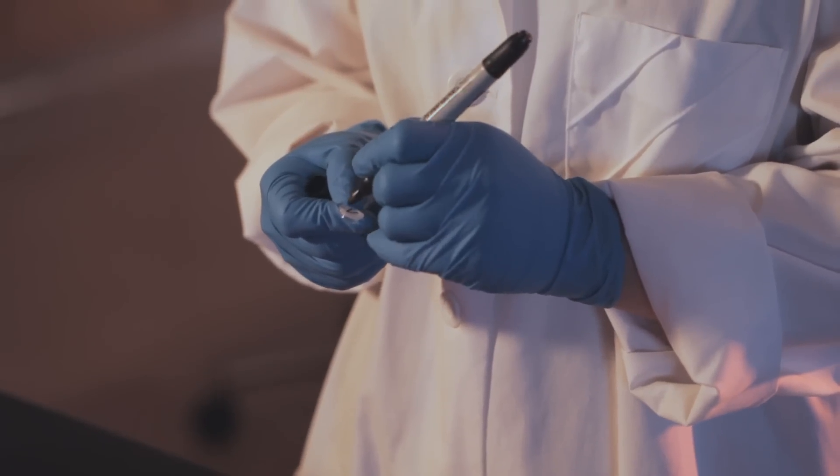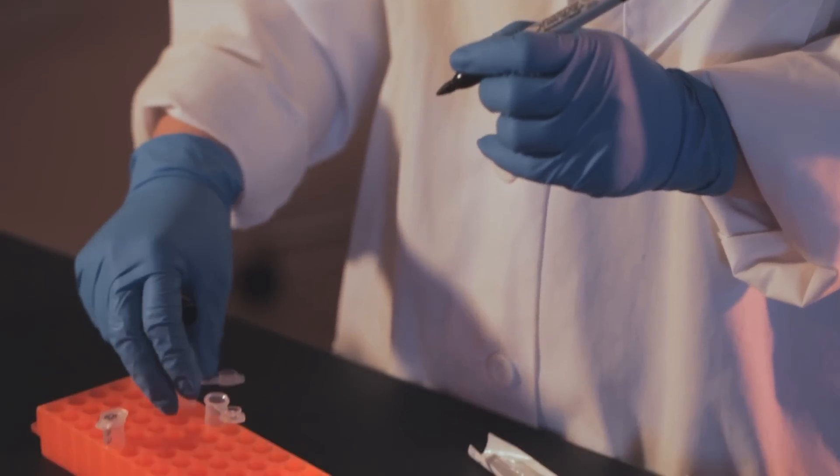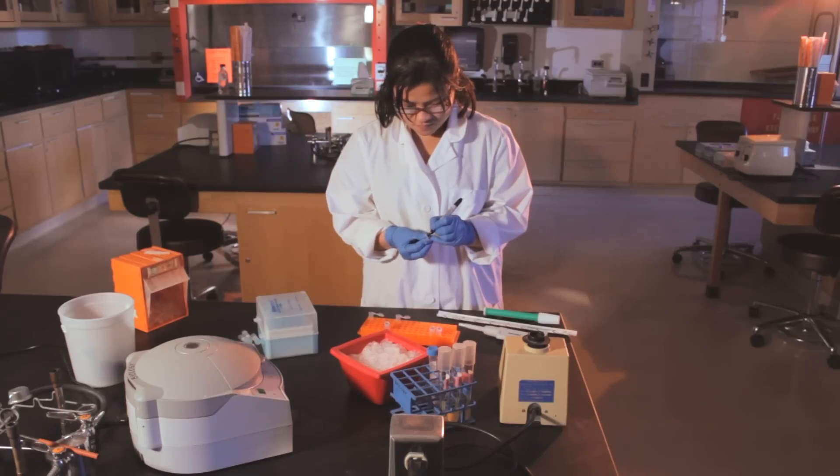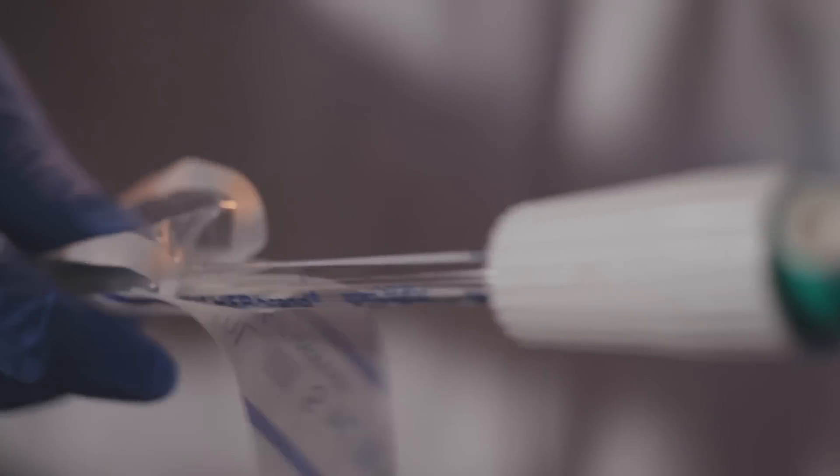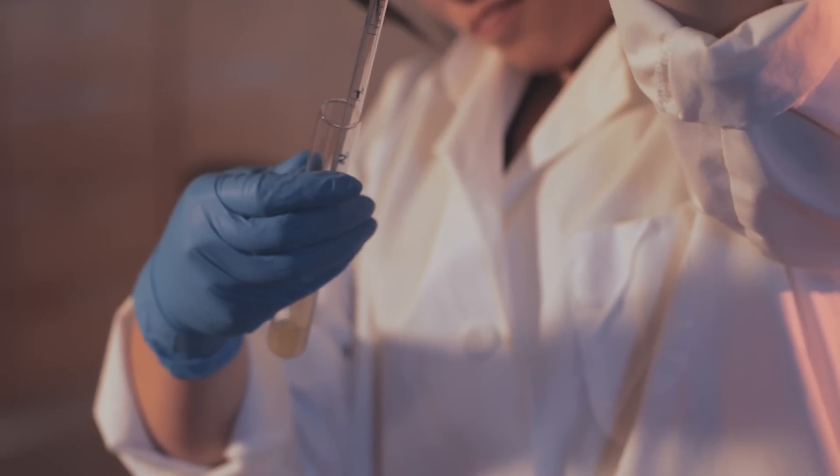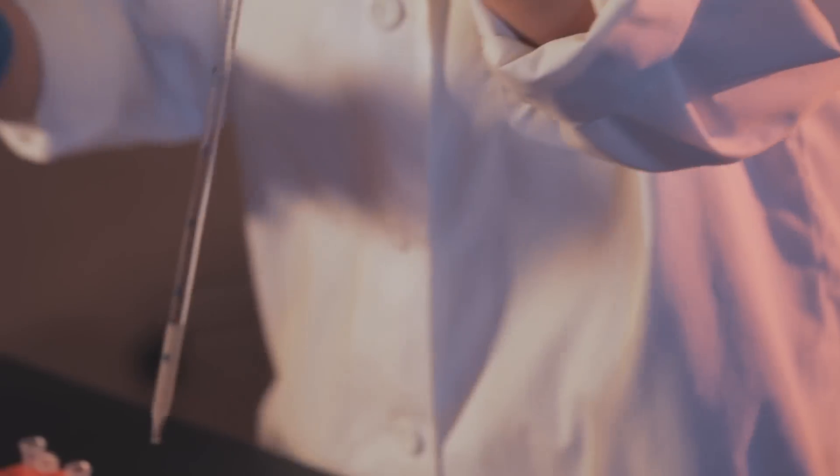Label the 1.5 milliliter microfuge tubes you will need. You will label one tube per culture. Using sterile 5 milliliter pipettes, pipette 1.5 milliliters of each culture into the appropriate labeled microfuge tube. Use a fresh pipette for each culture to avoid contamination.